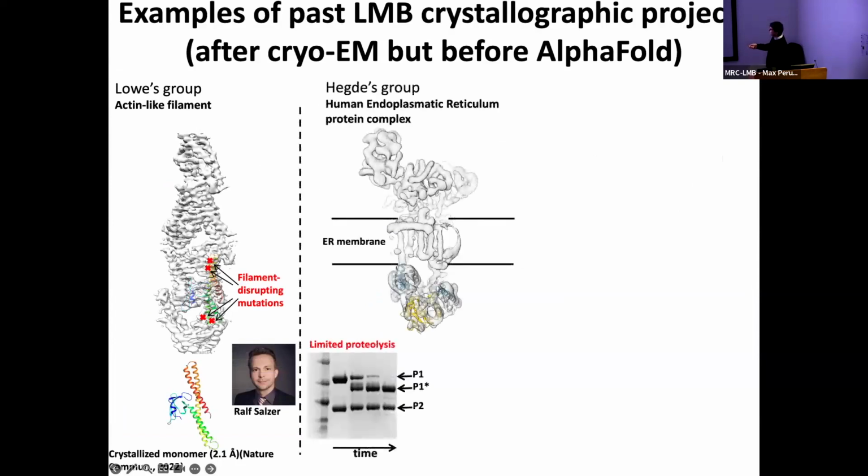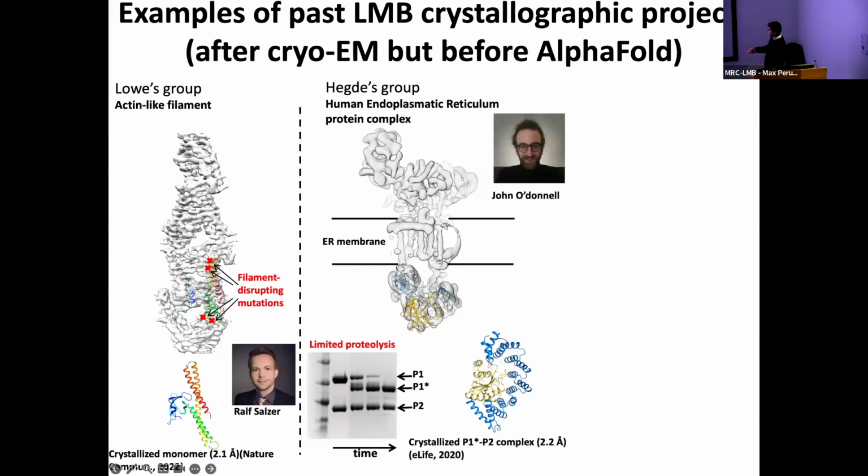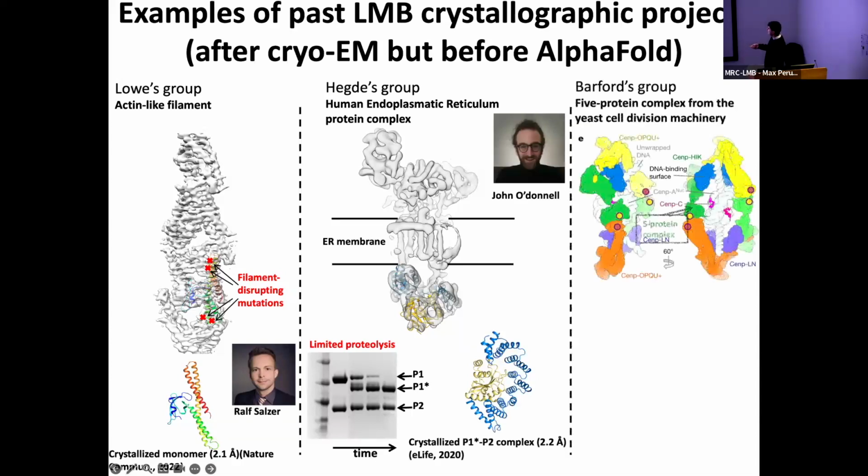Same concept here. This was done with limited proteolysis. As you can see, the resolution was very low. It's impossible to build the model. But then it was easy to plug the model into it once we solved it by crystallography, at high resolution. Similar concept here.